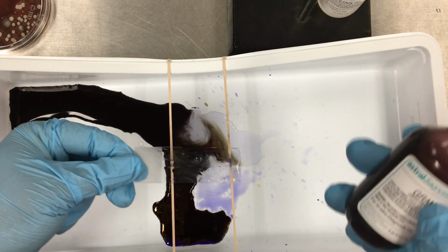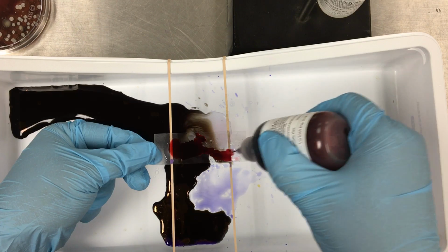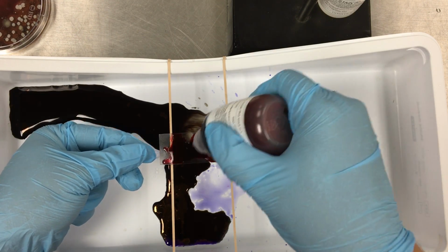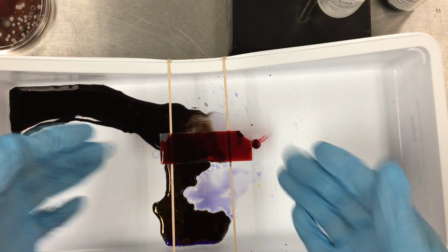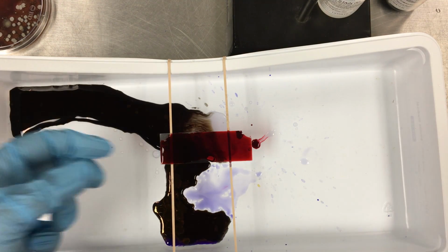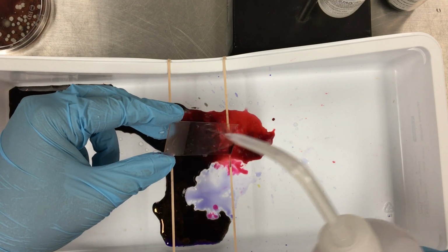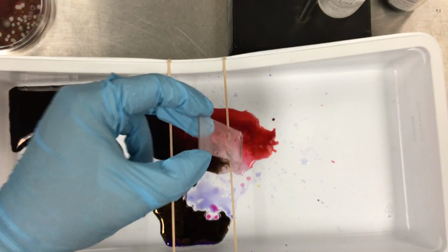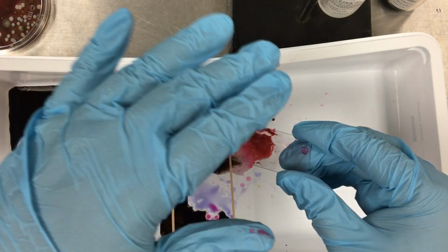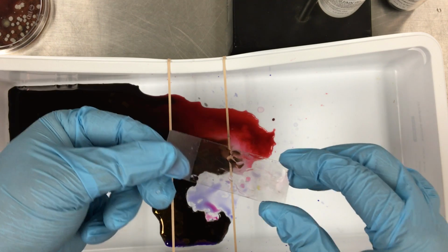Okay, and now we're going to come in with the counter stain, which is Safranin. Where this one, again, we're going to cover the whole slide. And this is only going to sit for 45 seconds. After 45 seconds has elapsed, you can do your final rinse with more distilled water. And you can let this air dry, or you can place it in a booklet of blotting paper just to pat it dry. And then once it's completely dry, it's ready for viewing on the microscope.